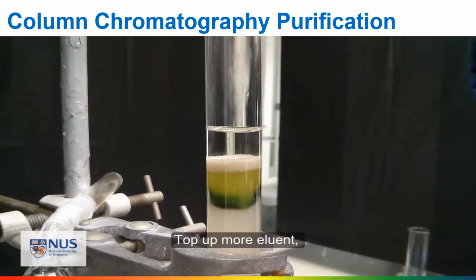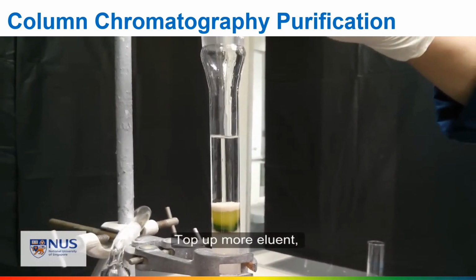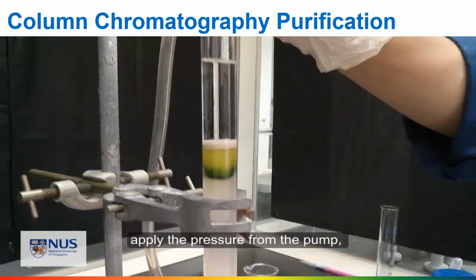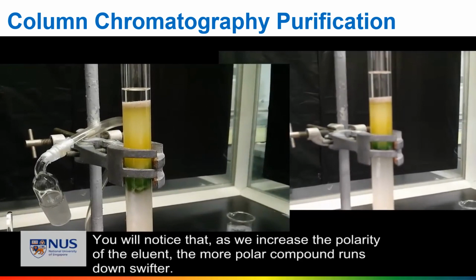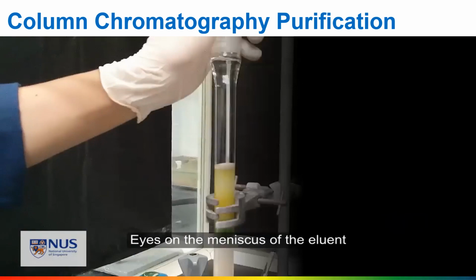Add more eluent. Apply the pressure from the pump and collect the fraction in a new test tube. You will notice that, as we increase the polarity of the eluent, the more polar compound runs down swifter. Notice how the green band flows down gradually. Observe the meniscus of the eluent. Never let the column run dry, remember.